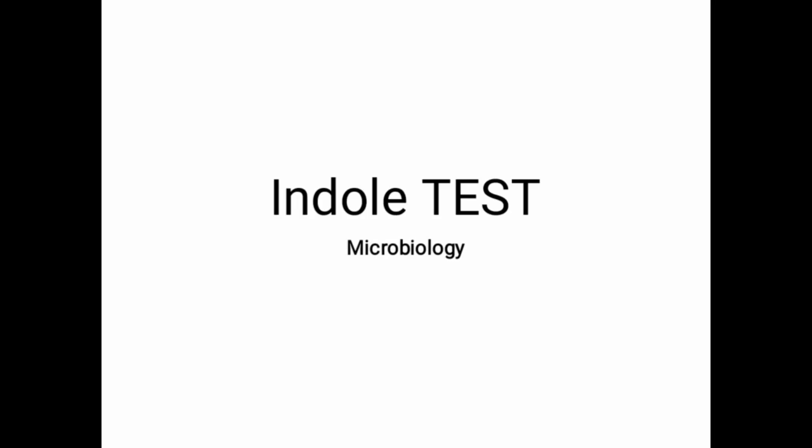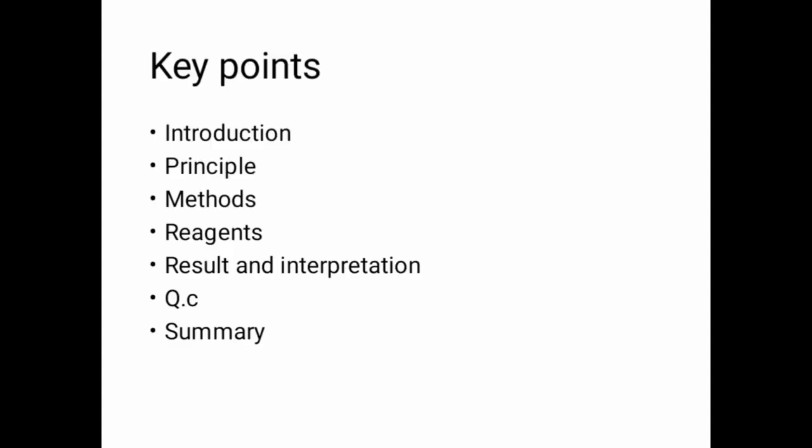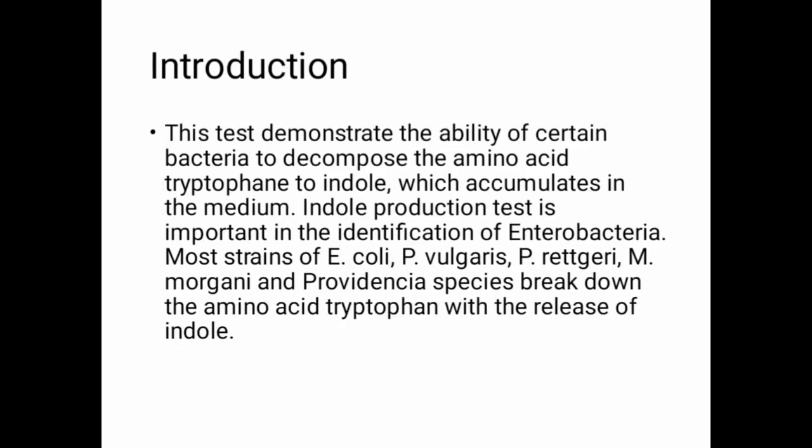Hello, this is microbiology. Today we'll be discussing another basic topic, that is the indole test. So this is the main key point for today's topic introduction. We discuss the principle, method, reagents, result and interpretation, quality control, and summary of this test. So let's start the introduction of the indole test.